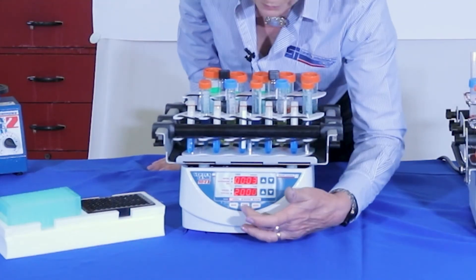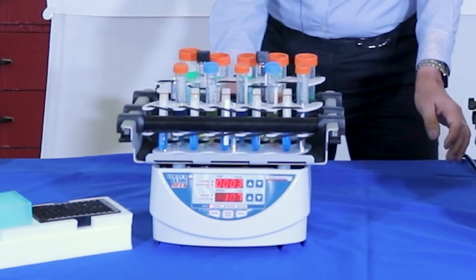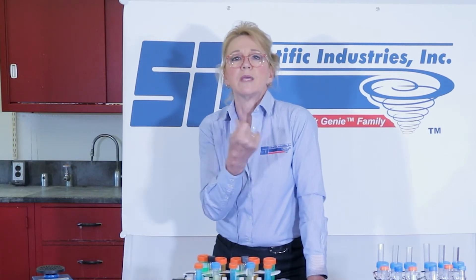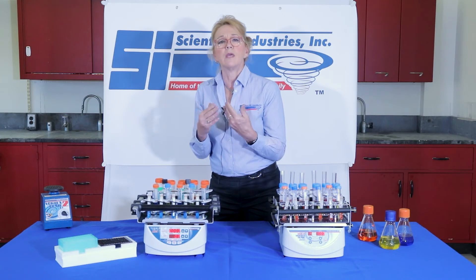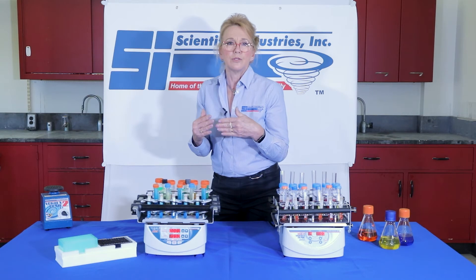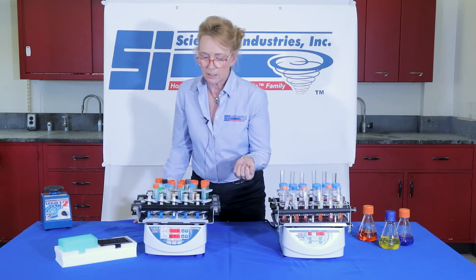I can change it to reverse mode just by pressing the mode button, then hit the start button. Your sample will be mixed clockwise and then counterclockwise. One of the benefits of reverse mode is to keep samples that may adhere to the sides of containers or tubes from sticking, so it removes that and you get a nice homogeneous mix of your sample.